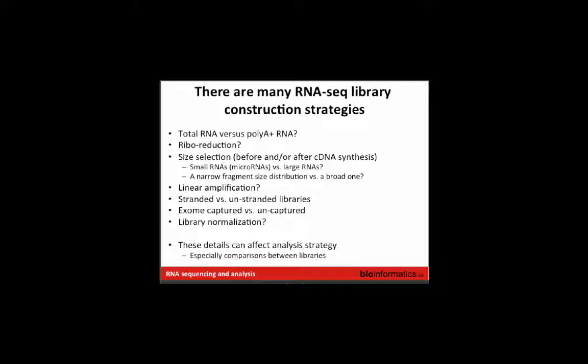But now this is built into the library construction, where the reads are encoded with which strand the read came from.